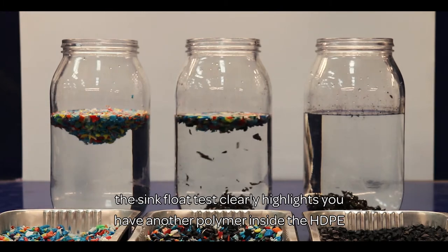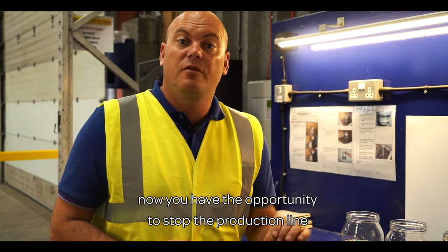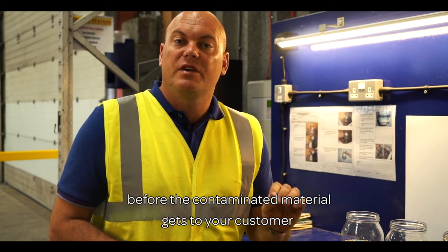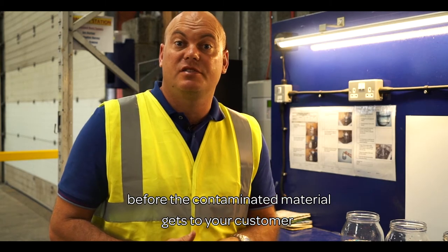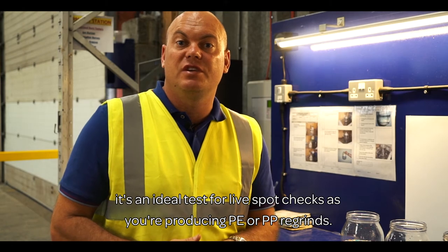The sink-float test clearly highlights when you have another polymer inside the HDPE. Now you have the opportunity to stop the production line and investigate further before the contaminated material gets to your customer. It's an ideal test for live spot checks as you're producing PE or PP regrinds.